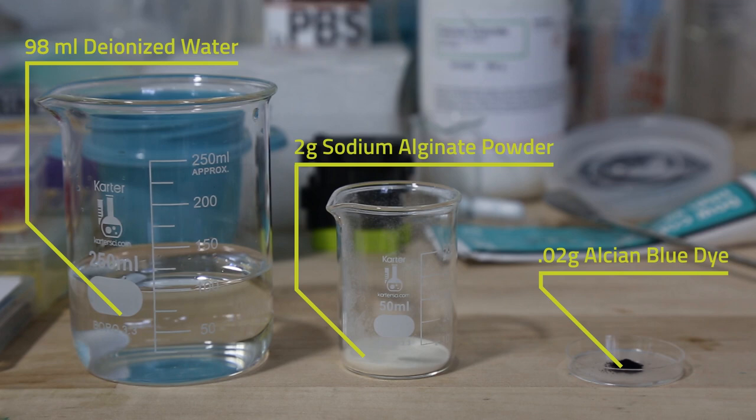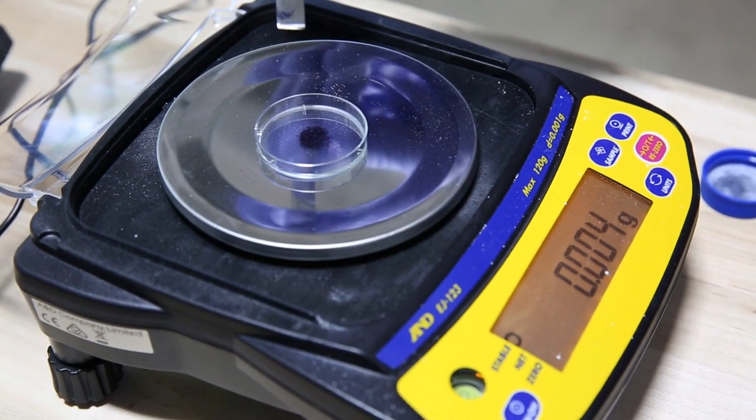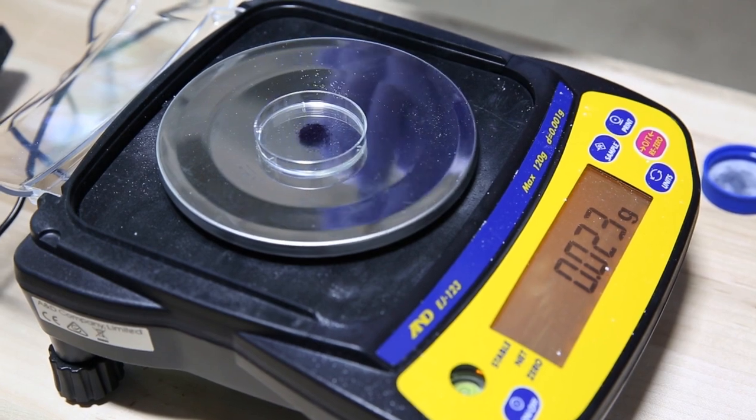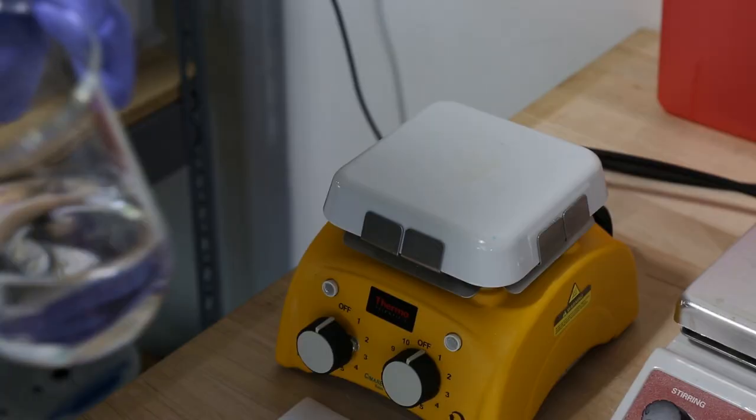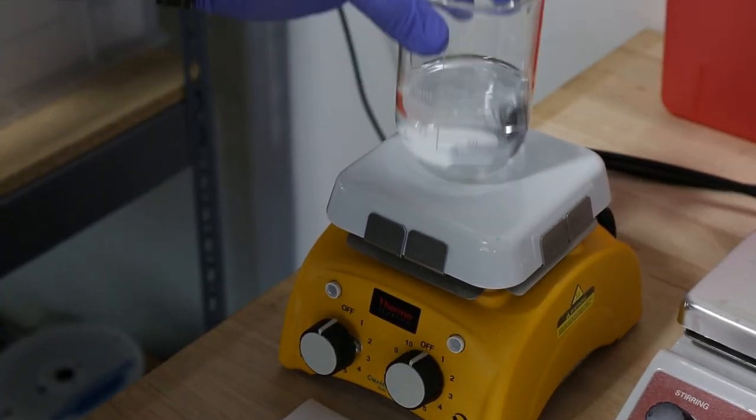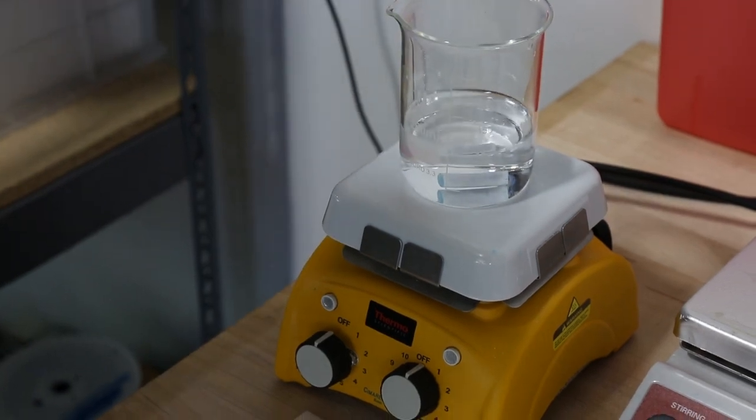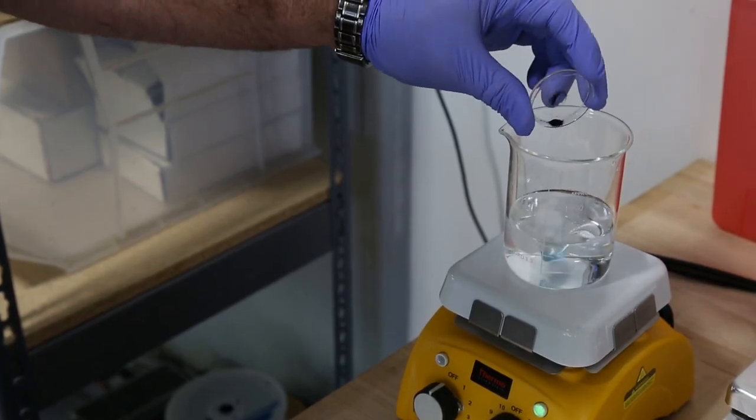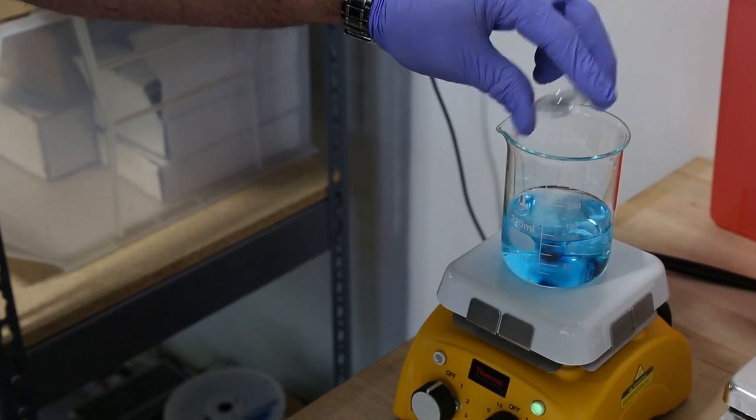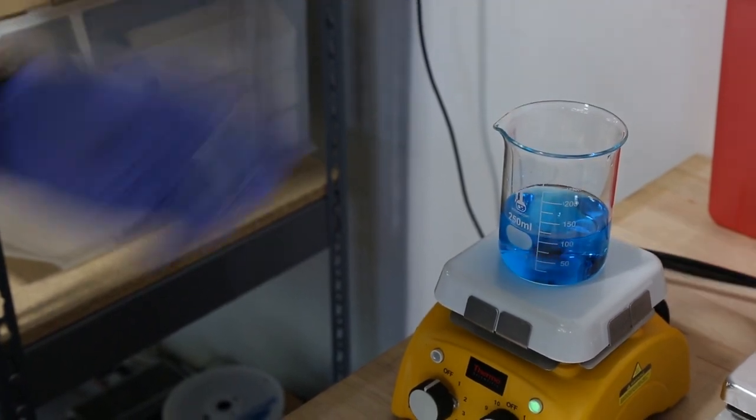The dye is because the sodium alginate is clear so we want to be able to see the print when it's printing. So we've got our 98 milliliters of deionized water with a magnetic stirrer. Then we're gonna add our 0.02 grams of Alcyon blue dye and this stuff is gonna make it really blue really fast.